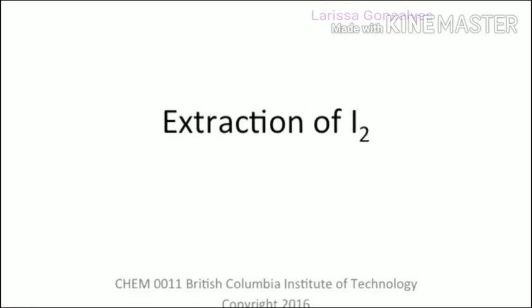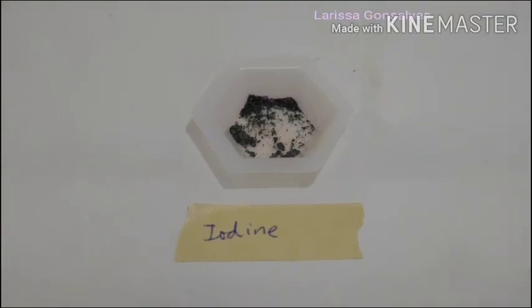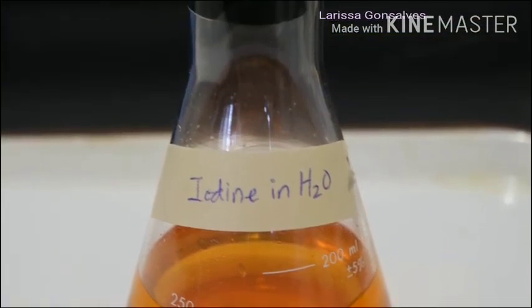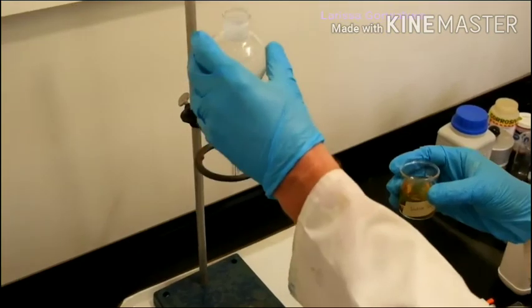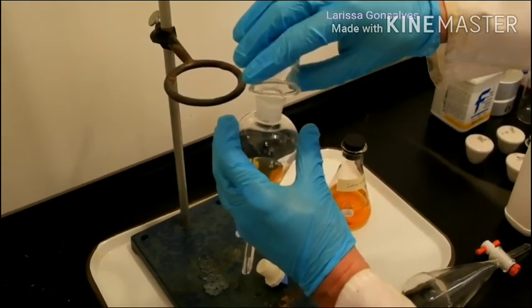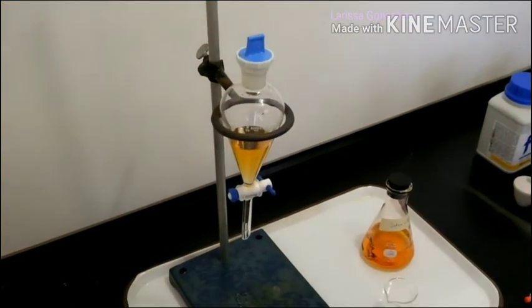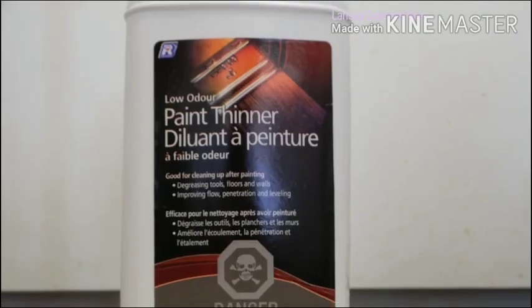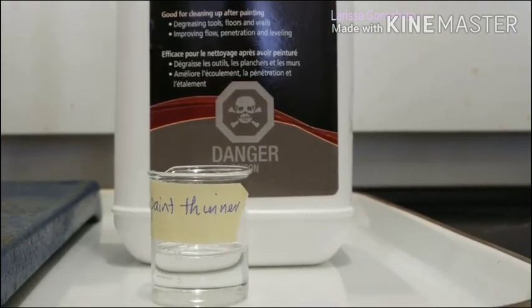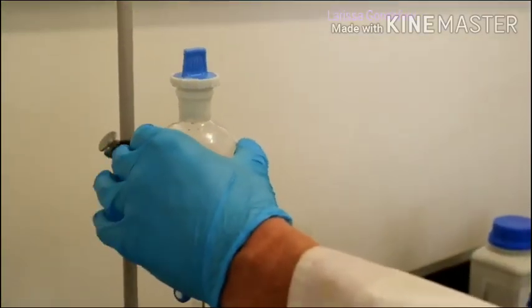Welcome to the video on the extraction of iodine from an aqueous solution. Pure iodine is a purplish solid. Iodine is slightly soluble in water. When iodine is dissolved in water, it gives an orangish colored solution. The aqueous solution of iodine is poured into a separatory funnel. Paint thinner is a colorless liquid. It is a mixture of organic solvents. Iodine is more soluble in paint thinner than it is in water. Paint thinner is added to the separatory funnel.